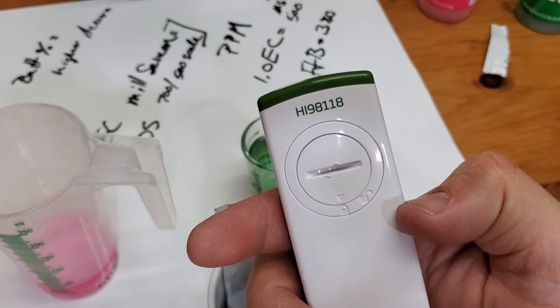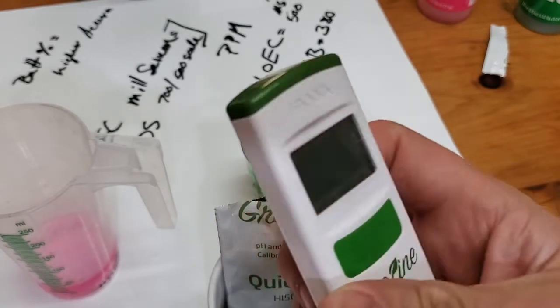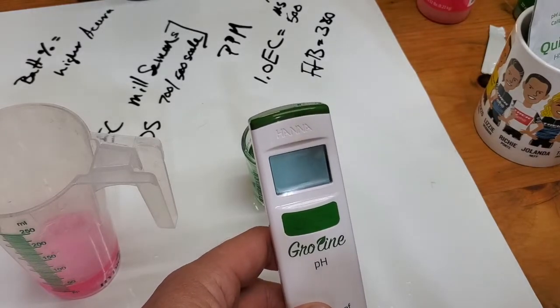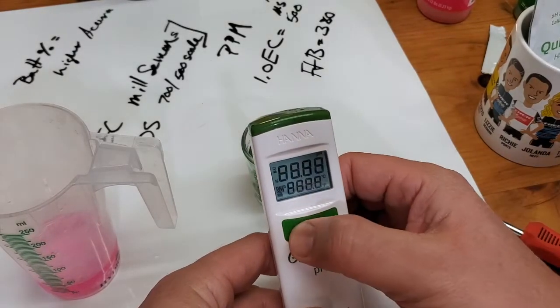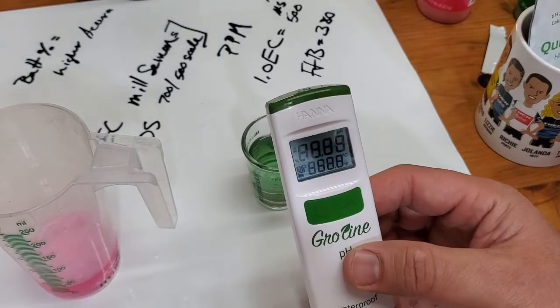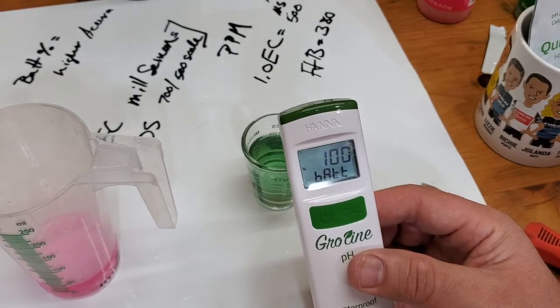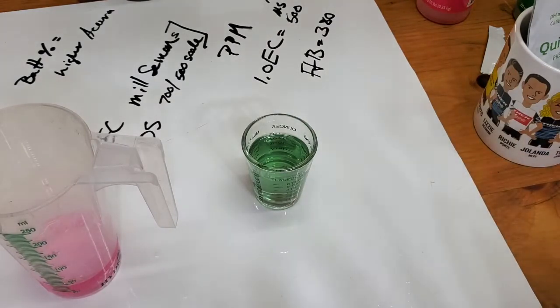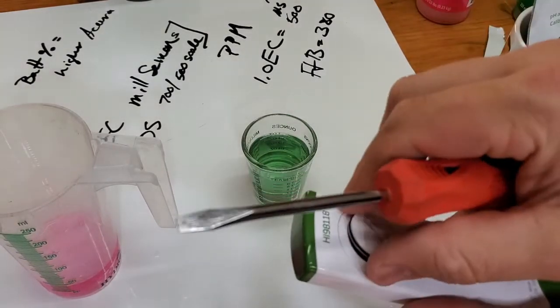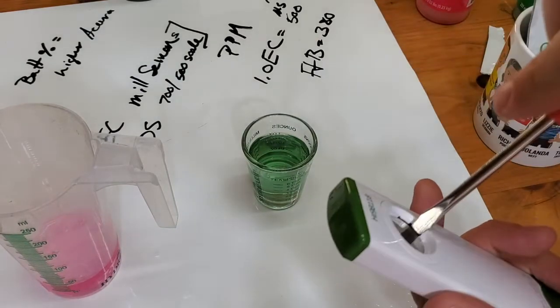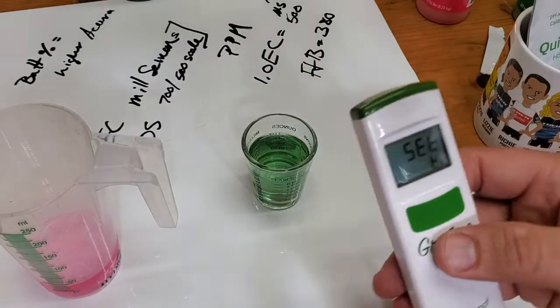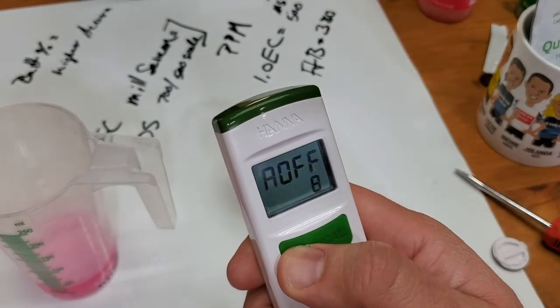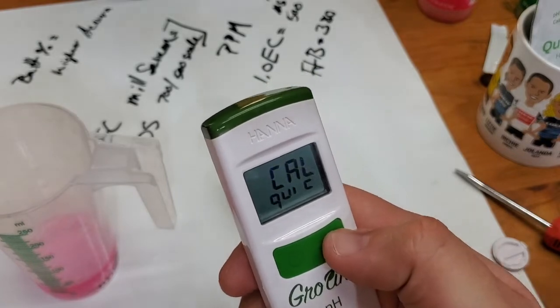All right, so we've got the 9811-8 pH pen and let's say we don't have any Quick Cal on hand and we need to do a standard calibration. We go back in, we open this up, we push the little button to get into the menu. We toggle through the Cal standard and turn it back on.